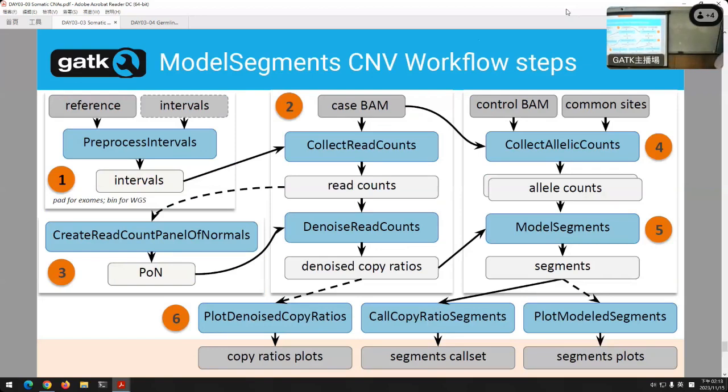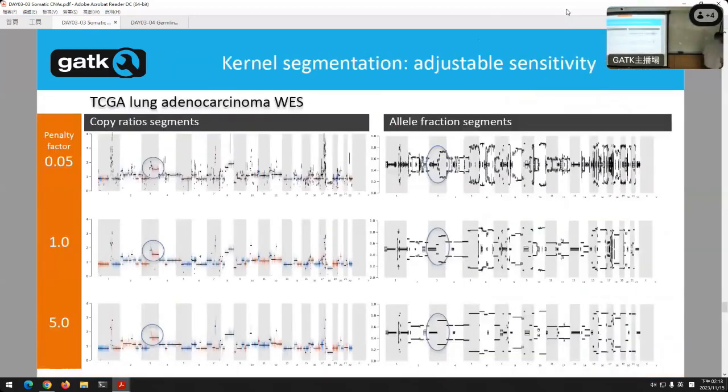Okay. So you're talking about this here, and I think usually the default works. This is just showing you what happens as you adjust the numbers. Usually you'll just start with a standard one. If you start with the default in the GATK and you get something that looks like this, you'll plot it yourself and say, wait, this doesn't look good. Then you'll increase it a little bit each time. It's a very quick process. It doesn't take long to run.